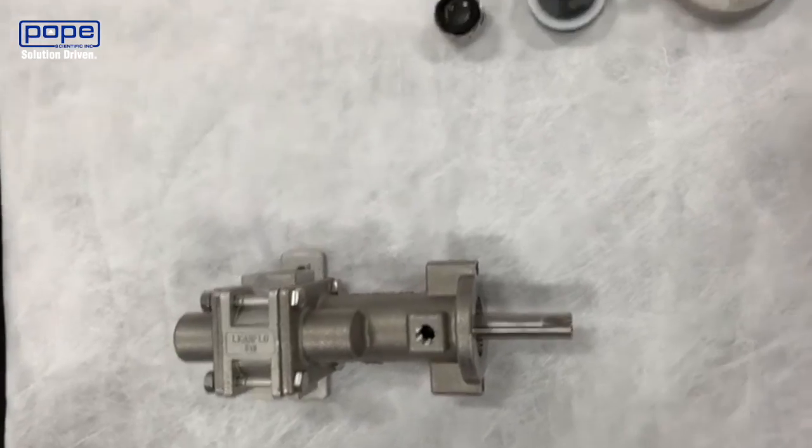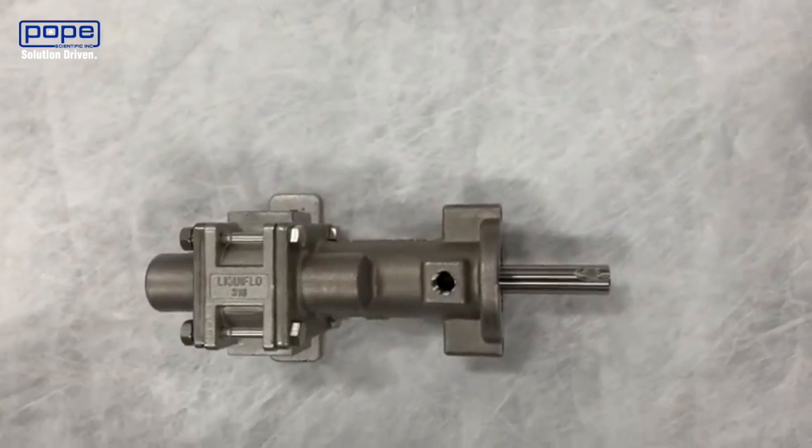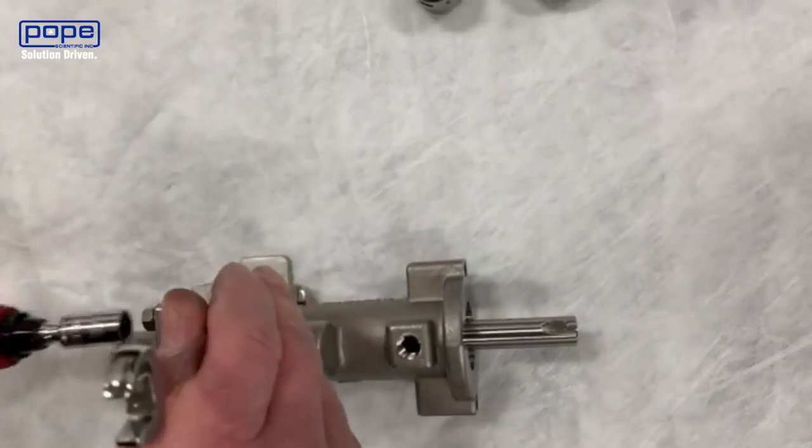Now the mechanical seal has been removed. We're going to take the housing apart, so we're going to loosen the four housing bolts.